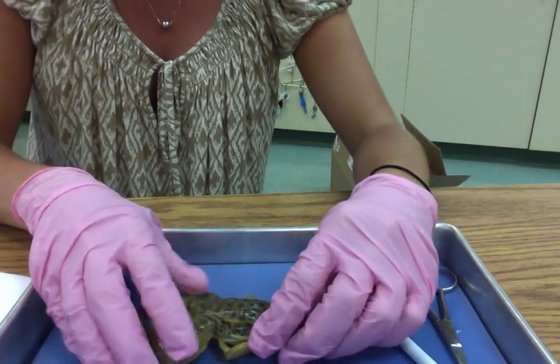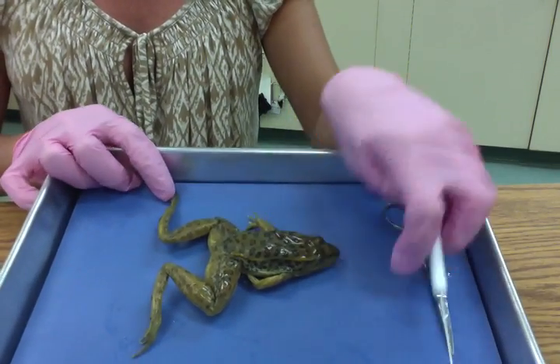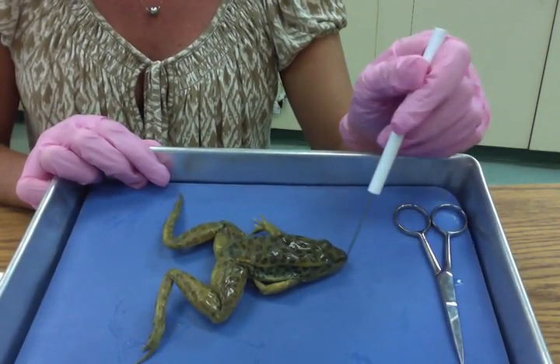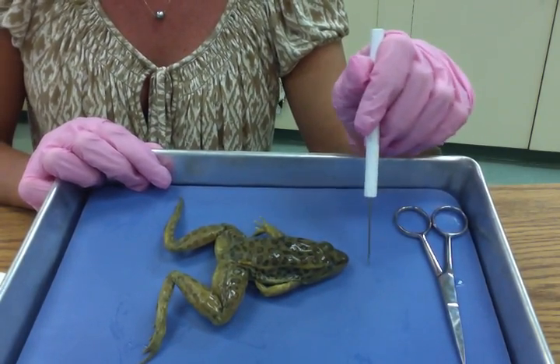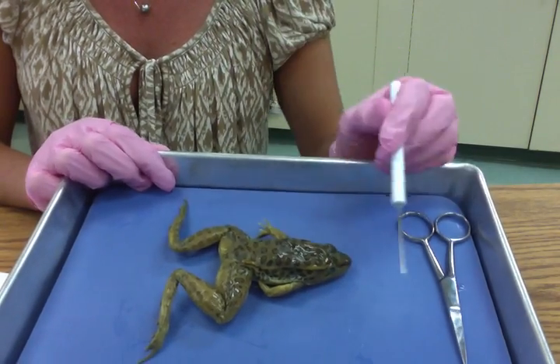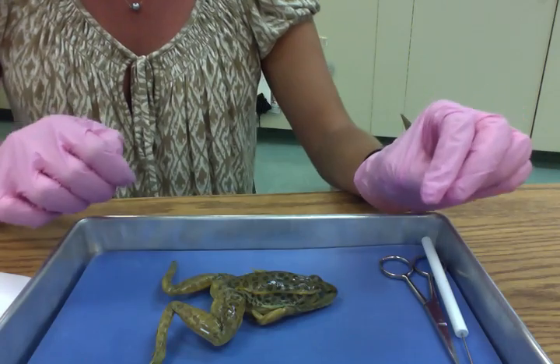At this point, you're going to draw and label the external anatomy of your grass frog. So what you're going to want to label is the eyes, the tympanum, the mouth, the tongue, so you might want to draw the tongue sticking out, how you saw it, the forelimbs, and the hind limbs. So you may want to pause the video and take a moment to draw your external anatomy.